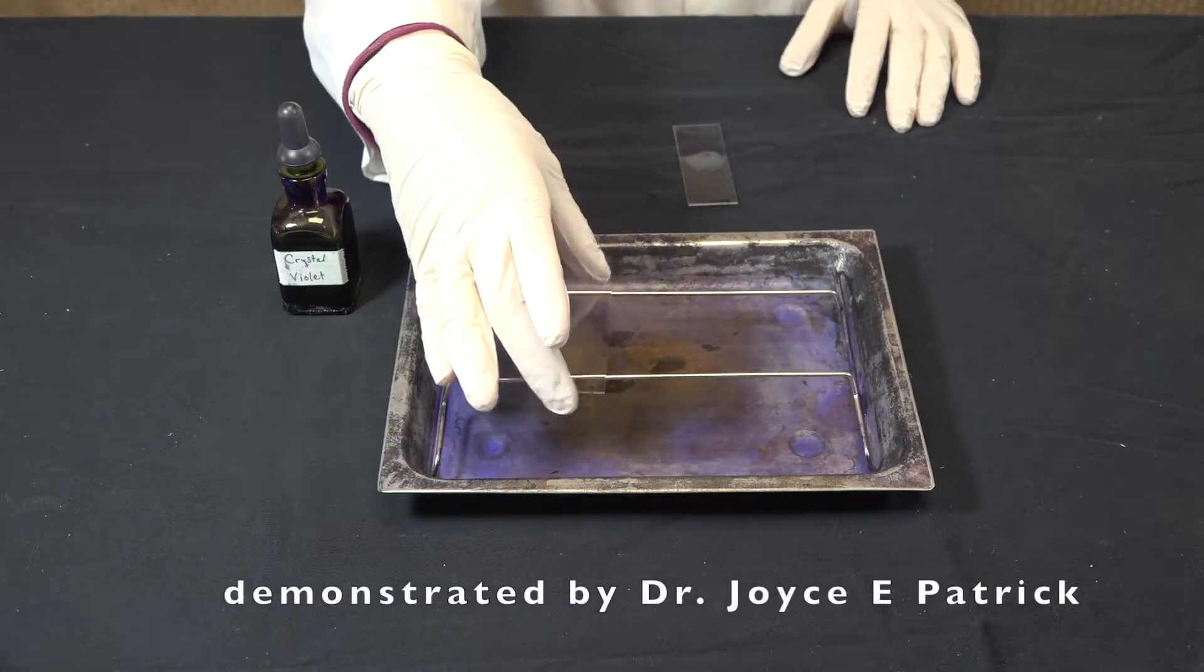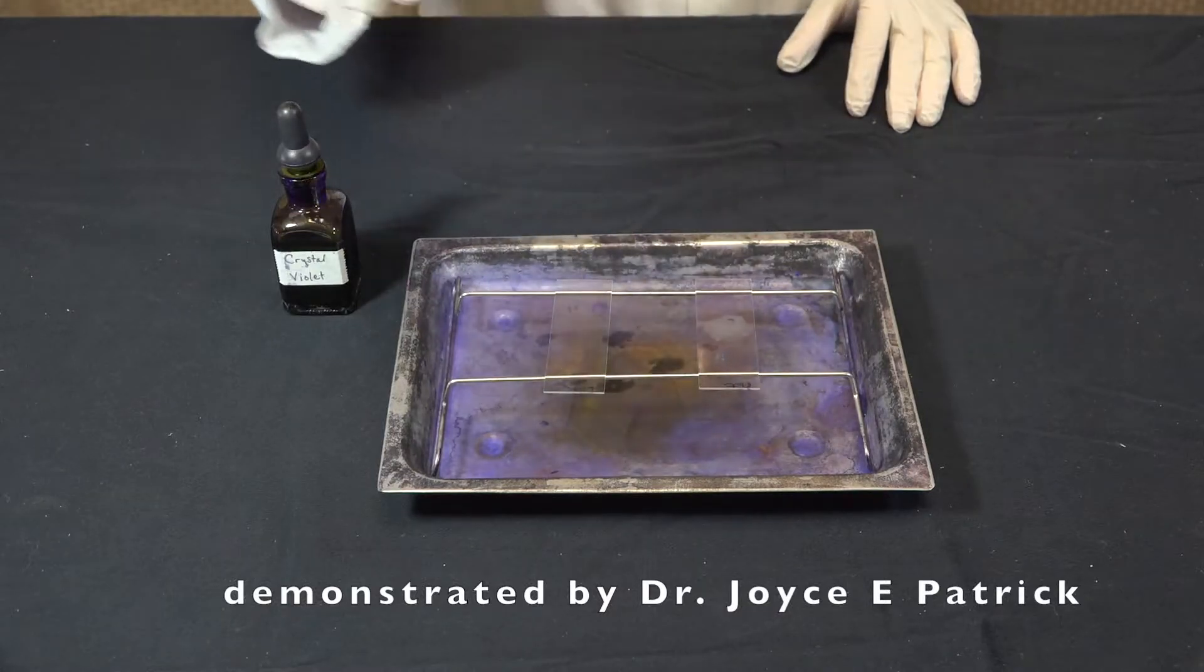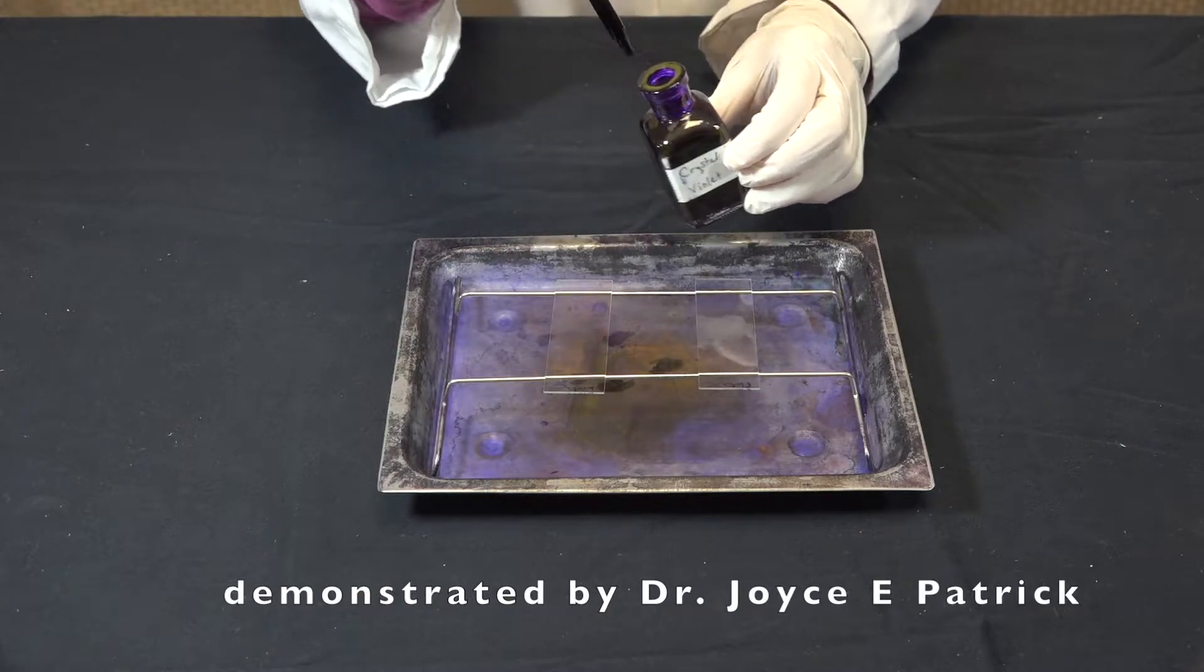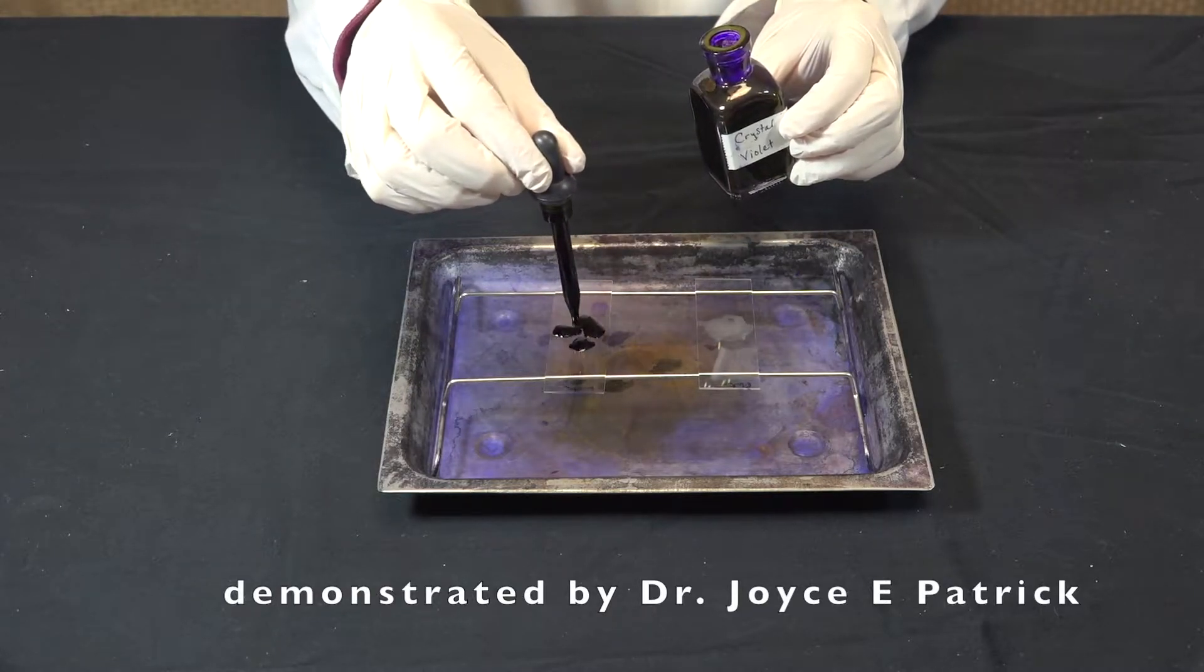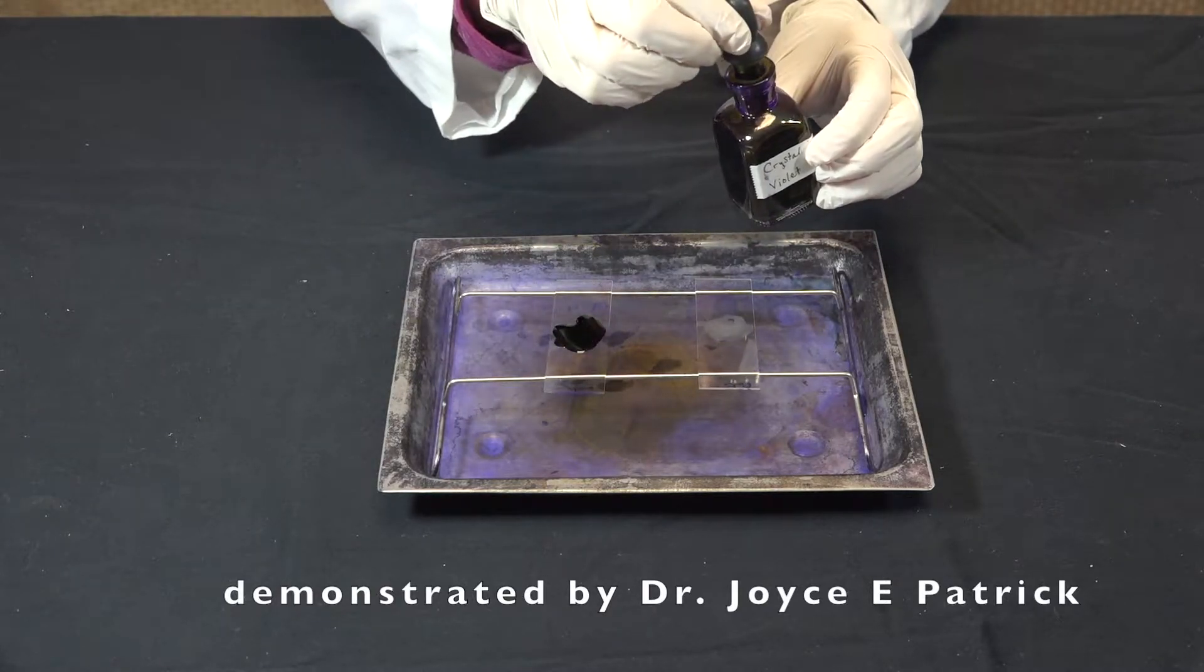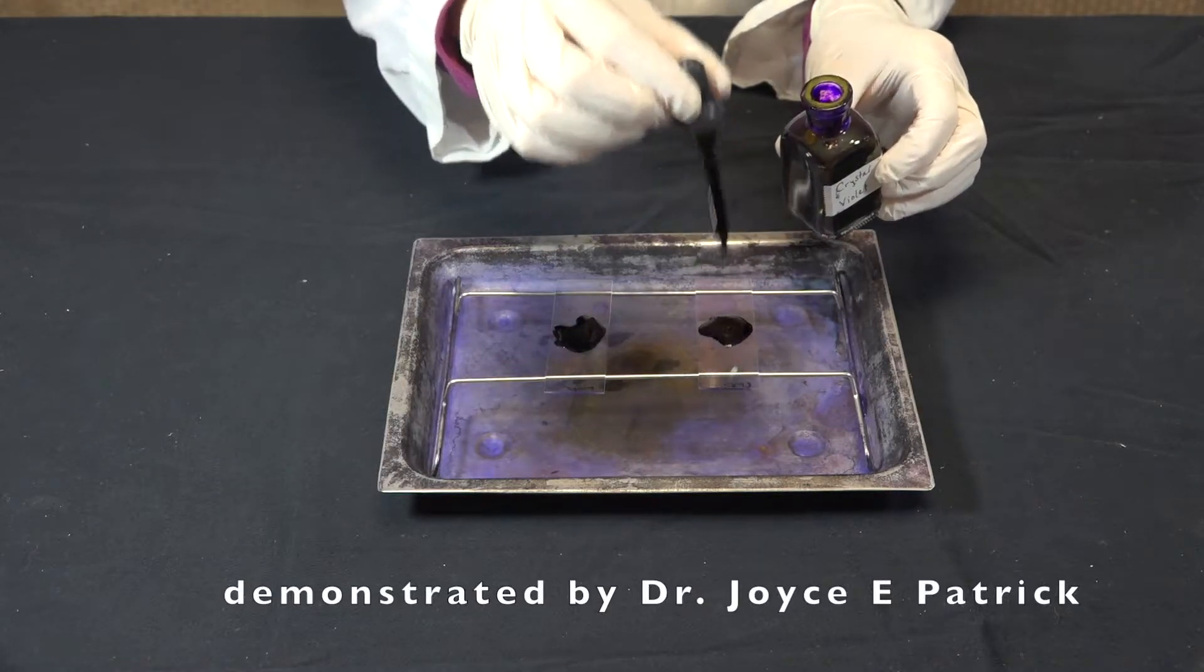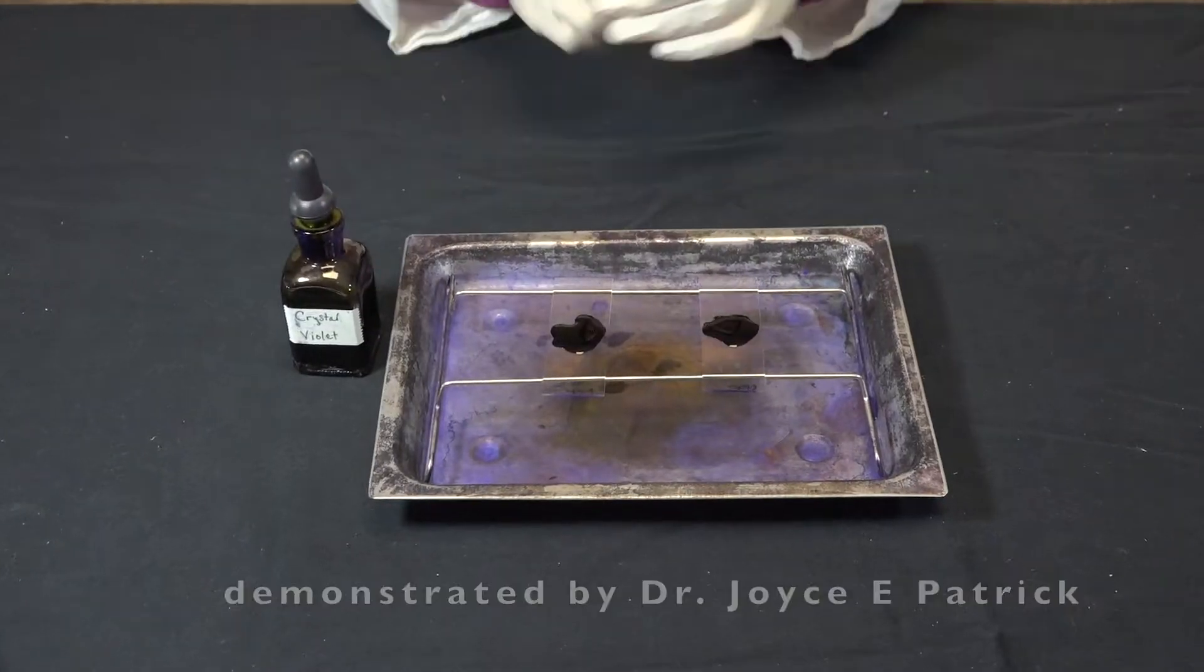I'm going to place my slides on the staining tray and add our primary stain crystal violet. Make sure you add enough stain to completely cover the smear. Now I'll wait 60 seconds.